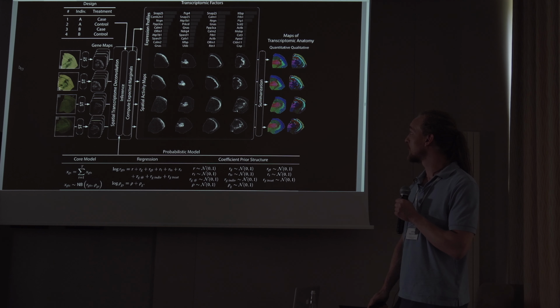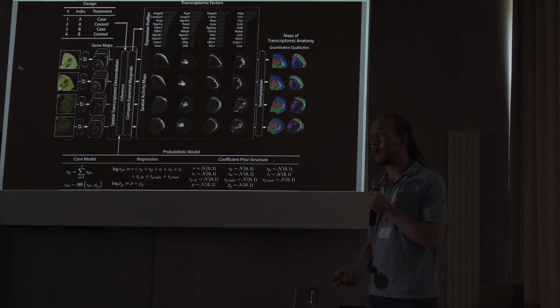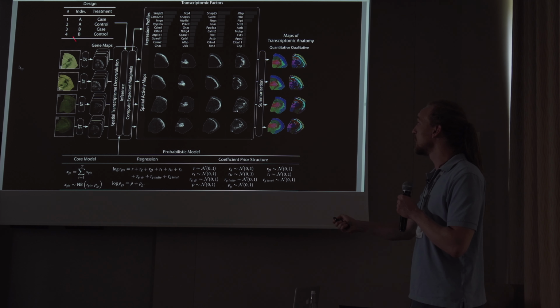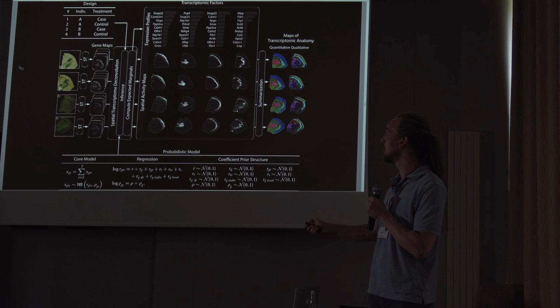So again, we would perform inference and then compute these expected marginals to yield these activity maps and the gene expression profiles. Important ingredients, and really crucial to extending the analysis to more than one sample, is that we reflect the experimental design, which here is indicated to contain samples from 2 individuals.